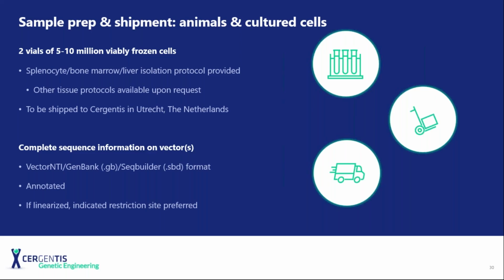And as we are located in Utrecht in the Netherlands, these are where the samples should be shipped to. And we always require, in the case of transgene integrations, complete vector sequence information, which can be safely uploaded to our portal, which allows us to design the TLA experiment.